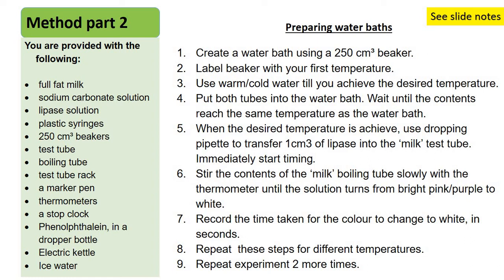So use warm or cold water until you achieve the desired temperature. Put both tubes into the water bath. Wait until the contents reach the same temperature as the water bath, and that's really important. So you're going to have your tube of milk solution and your lipase in a separate test tube. They've got to reach that temperature, so you've got to check and make sure they reach that temperature.